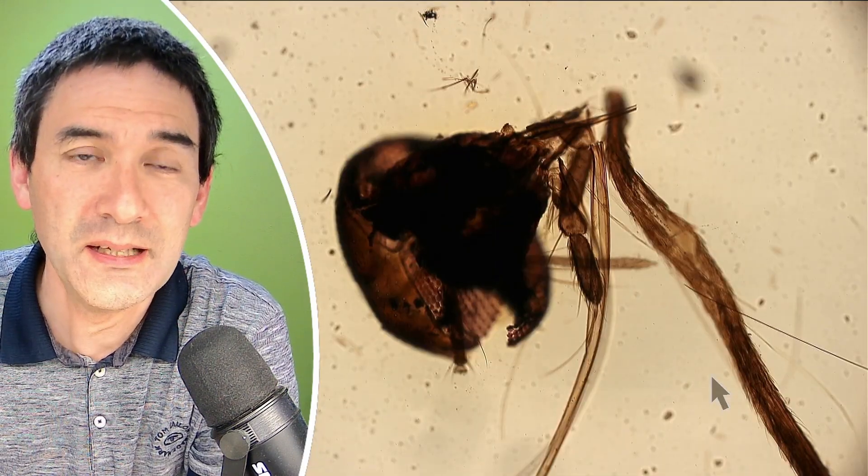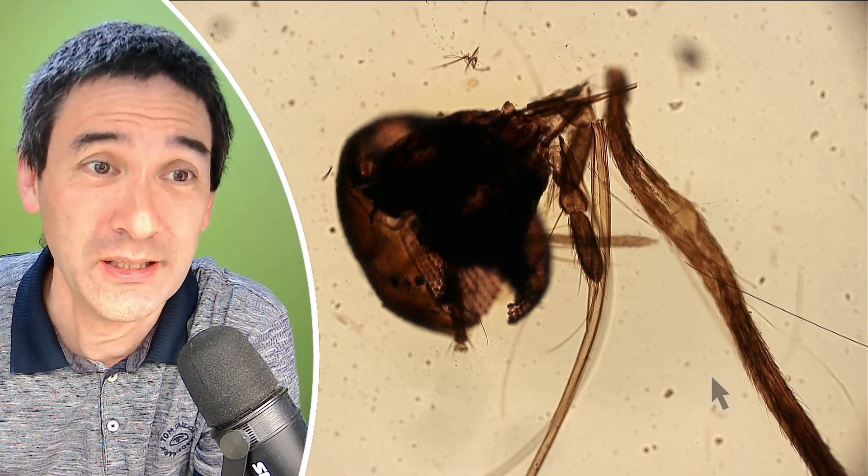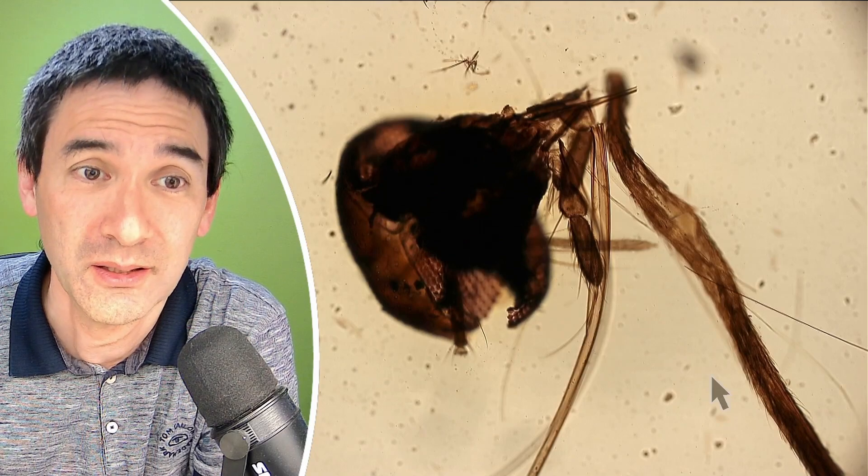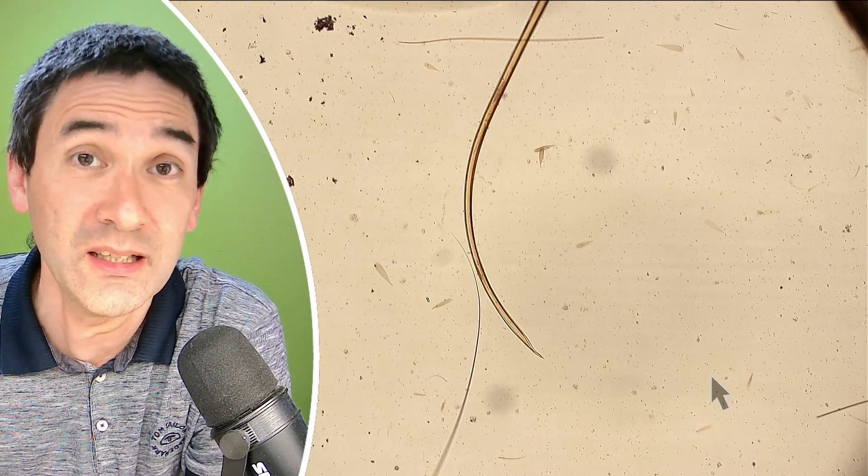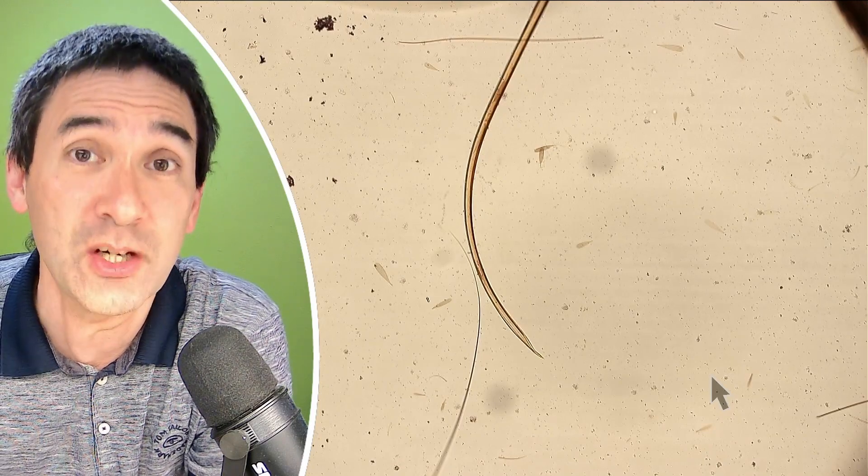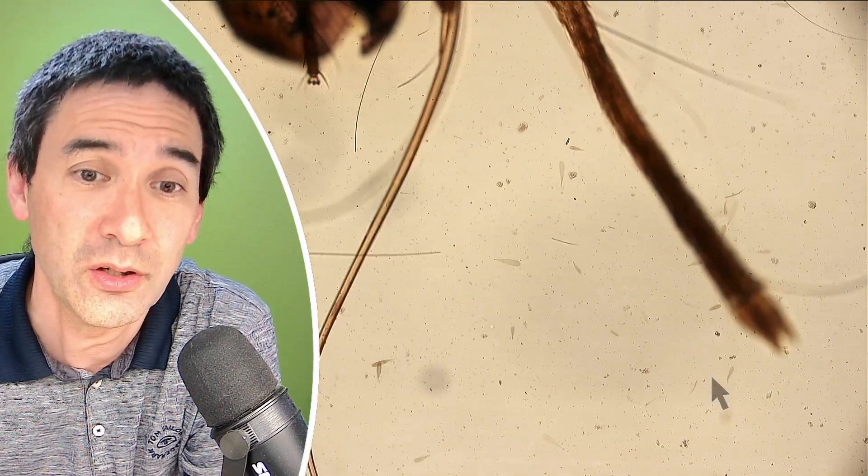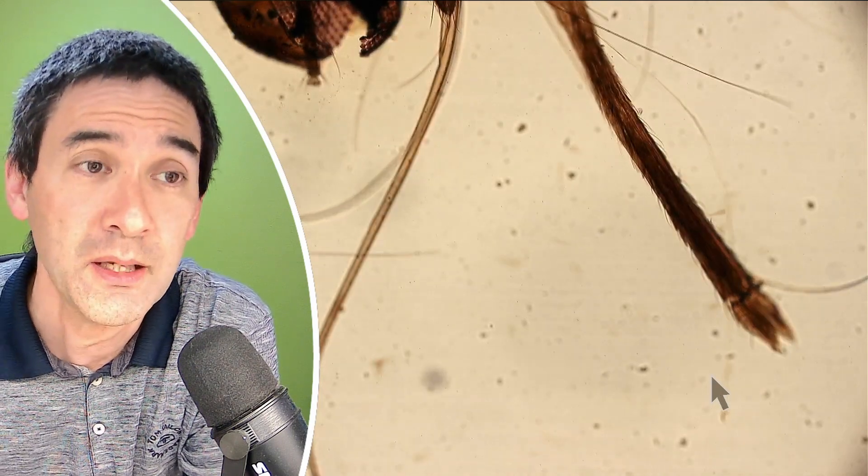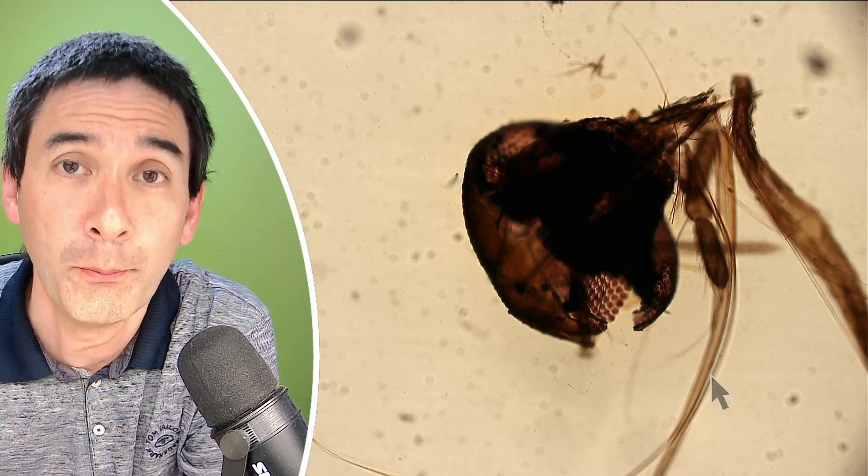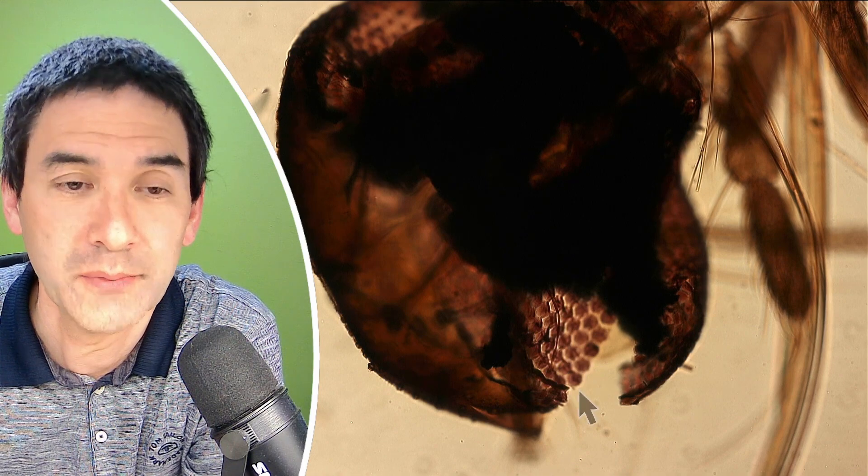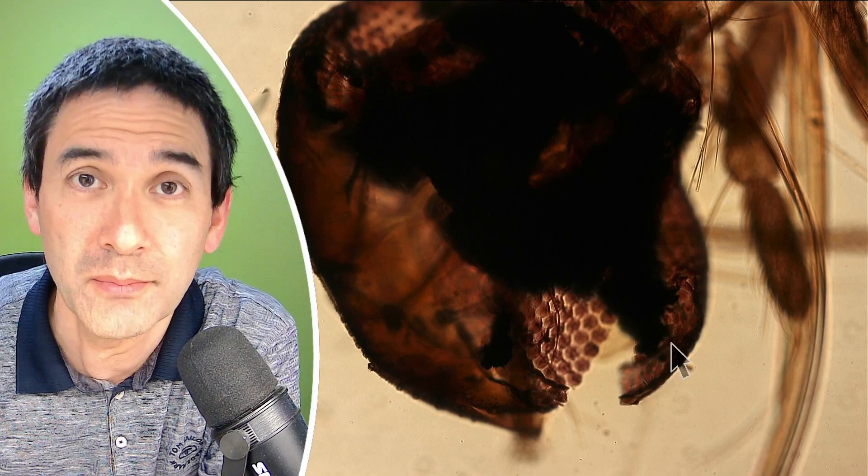But mosquito wings do look a little bit different, so I'm going to show it to you now as a reference. So this here is basically the head of a female mosquito. It's a commercially prepared microscope slide. It does not look very nice, lots of dust and dirt here. But what we have over here, this long extension that you see over here, that is the proboscis. And because it's a female mosquito, that is actually the part that actually pierces the skin to suck up the blood. But you see, that's not the only thing here. There are other mouth parts here on the side, which are used also for sensing. And also quite nicely visible over here. If we look at the head, you can actually see also the compound eyes. Look how broken the specimen is. So that is the female head.